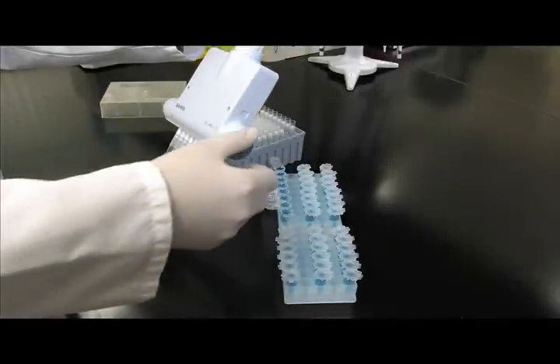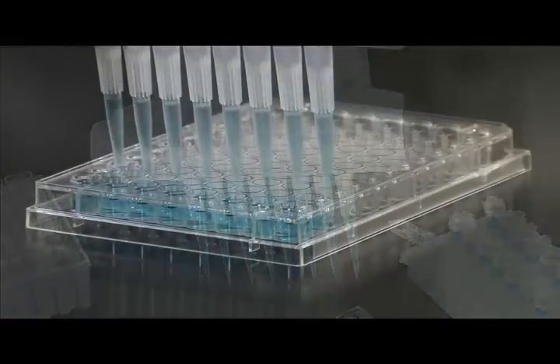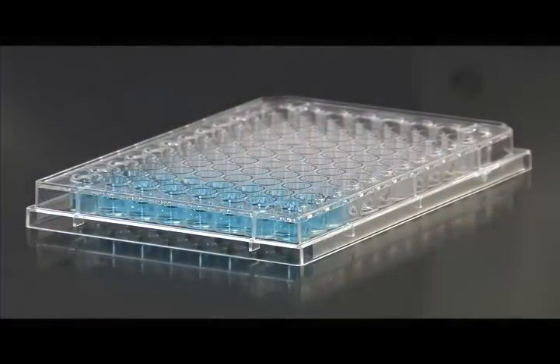Increase your productivity with Reynon's Pipette Light Adjustable Spacer. The world's only manual multi-channel pipette with adjustable spacing.